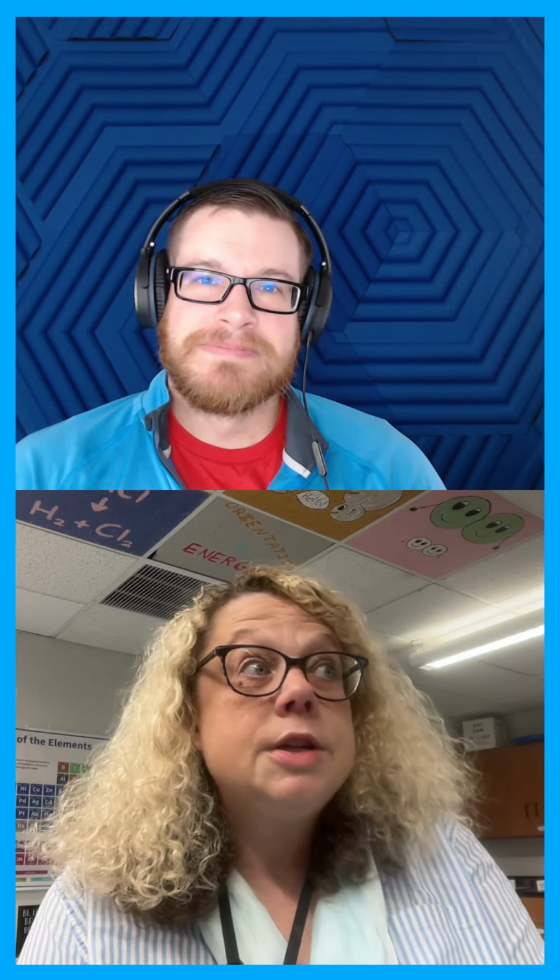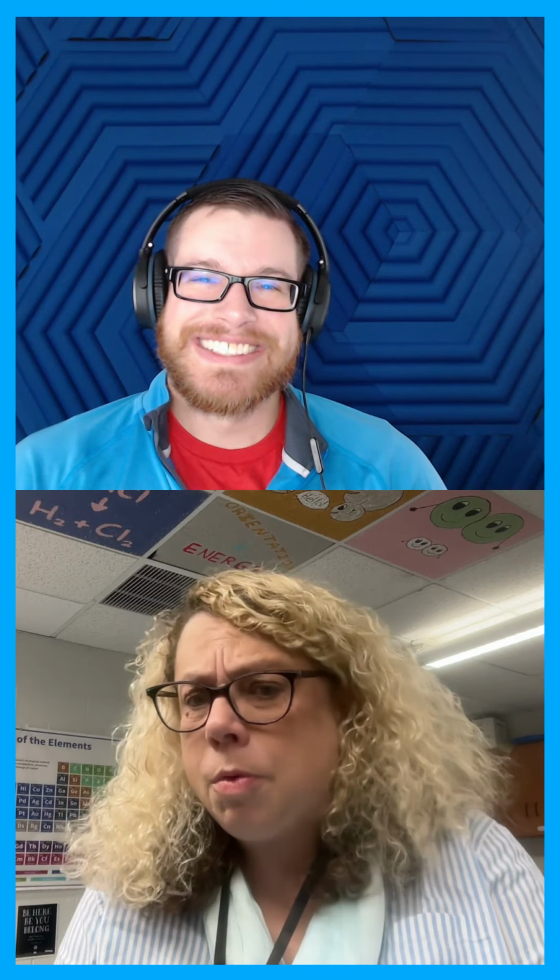So that's something that the College Board actually encourages all AP classes to do at least once, preferably more than once, so that the students really know how to do that. Actually, in my first year classes, we'll also do a gravimetric analysis lab where they have to collect a precipitate and filter it out. So we do a lot of filtration. That's a big separation method for me.